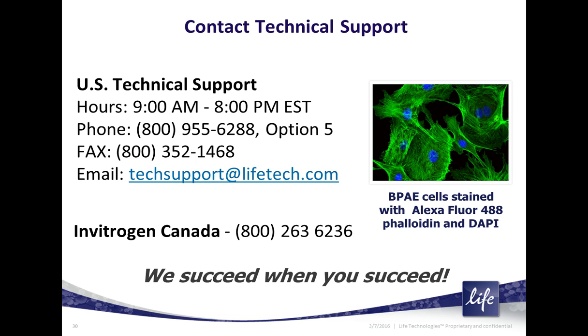How do antifades inhibit photobleaching is another question. Last question. Basically, the good ones, like ours, have an antioxidant component or free radical scavengers. When a dye is exposed to light, it creates free radicals and singlet oxygen, which can damage neighboring dyes and cause photobleaching, and it spreads.